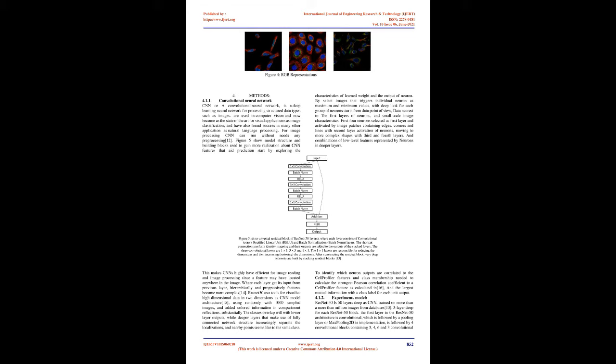So this research challenge requires both segmenting the cells in the images and predicting the labels of those segmented cells. A mask may have more than one class, which forces separate detections for each class using the same mask. All cells have their own features, shape, size, and distribution of proteins, and all of them have all 4 channels, with signals from the markers blue, yellow, and red.